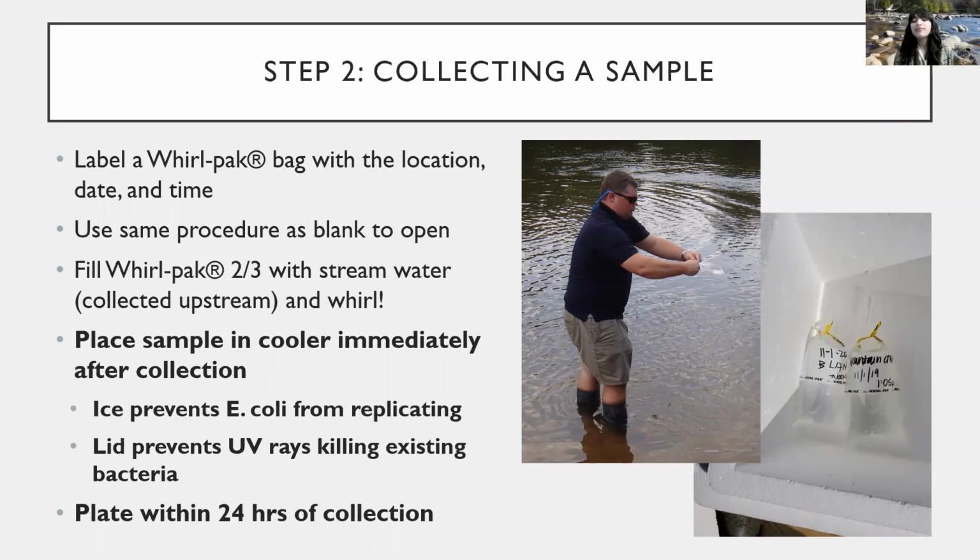Ooh, thank you, Gretchen, for pointing that out. This volunteer does not have gloves. I can let Bailey address that, but yes, it's very important to wear gloves because you never really know what might be at your site.